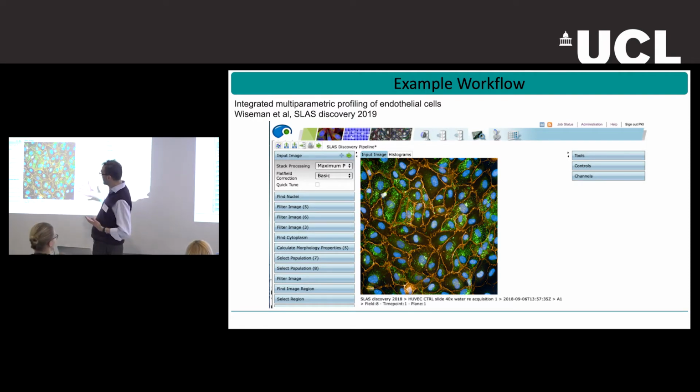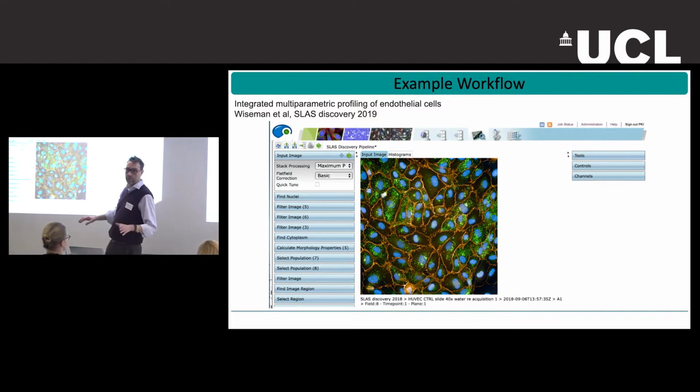And the staining that you see here, I also take for granted that when I talk about immunostaining, we are all on the same page. We are looking at endothelial cell junctions. The orange is VE-cadherin, which is basically an exclusive lineage marker for endothelial cells. The green, nice dots, is Notch, activated Notch, not the receptor, but what happens when you actually activate it. Another name for it is NICD. And we know that when this goes into the nucleus, it starts being transcriptionally active. And then in blue, we have the DAPI or Hoechst or whatever nuclear marker you like to use.